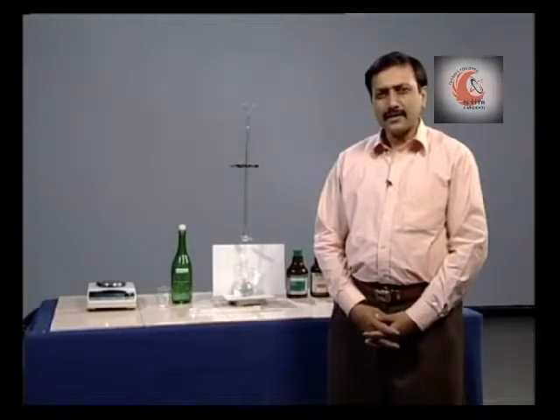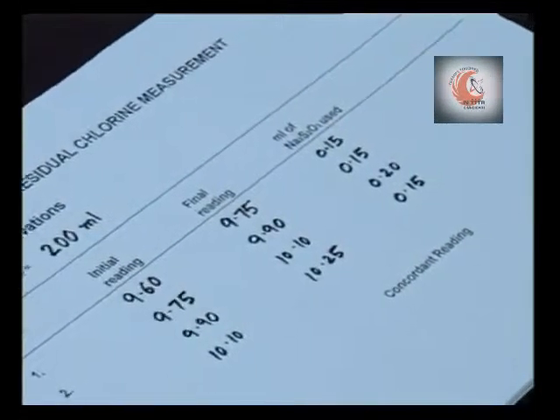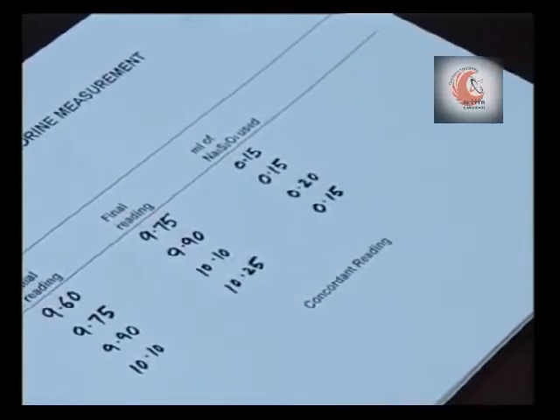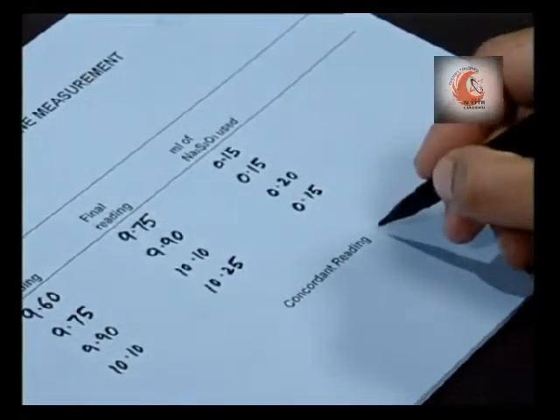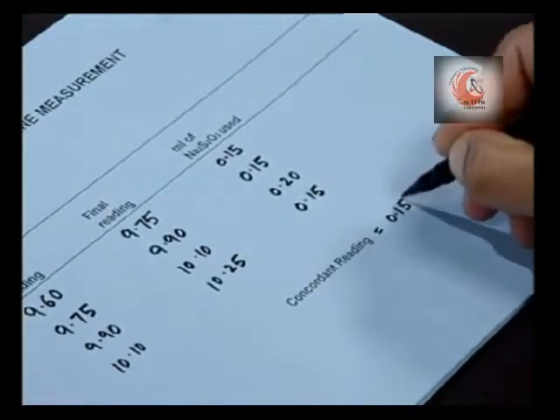Repeat the test till you get concordant values. The concordant reading is 0.15 ml.